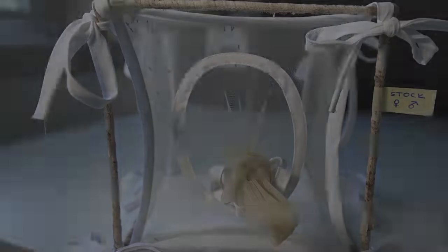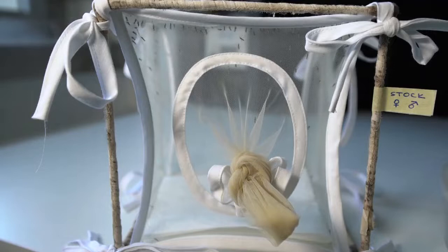Maintain Anopheles coluzzii Yaoundé strain mosquitoes in a room at 26 degrees Celsius, 75% humidity, and under a 12-hour to 12-hour light-dark cycle. House mosquitoes using standard insectary conditions in a single cage to guarantee mating. Use a plastic pipette to collect mosquito pupae.